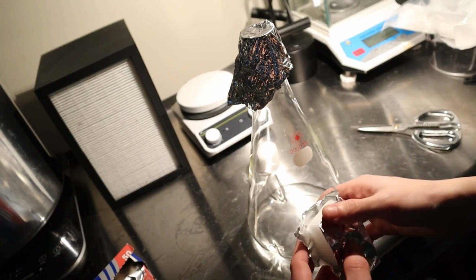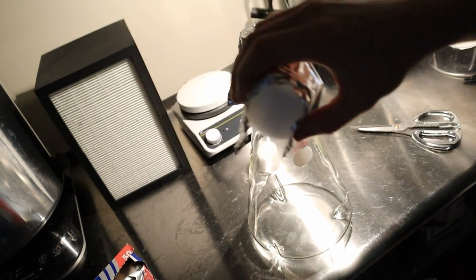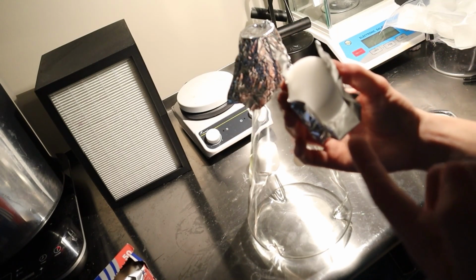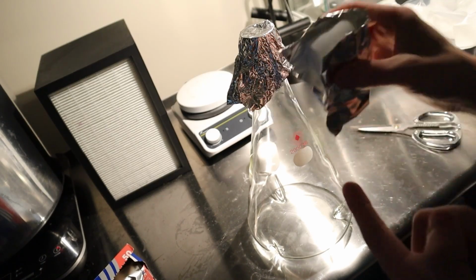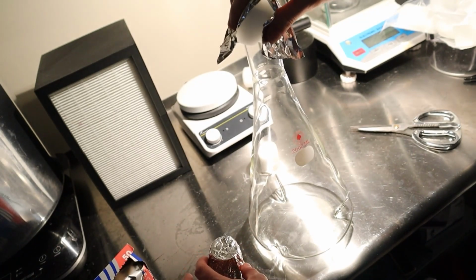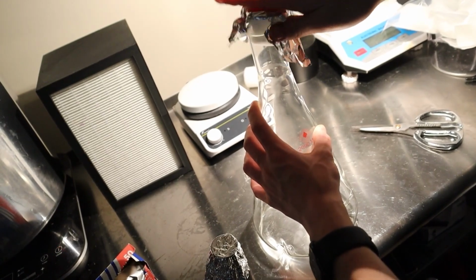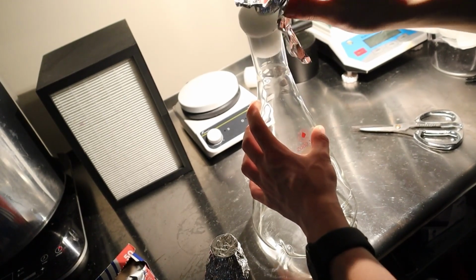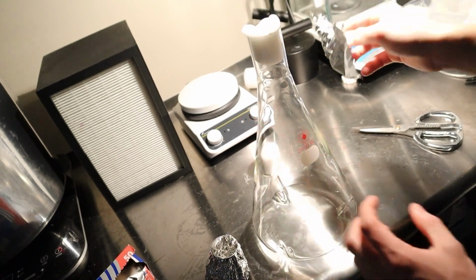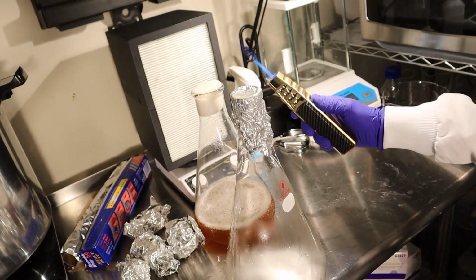But if I autoclave this right, probably a bit more foil, I'd fold the foil out of there like this, and I'd have a sterile foil touching the sides. Now I can get low on it without contaminating it, and this should, in theory, allow me to fully get this in here without ever getting my finger on it, or any part that isn't sterile. Now it's in here, and it's completely sterile.